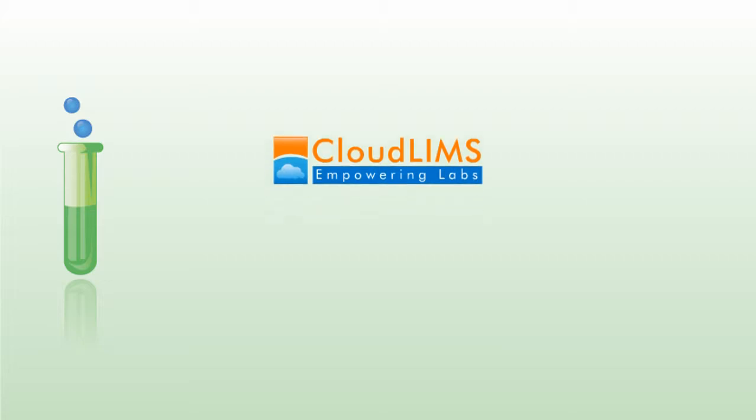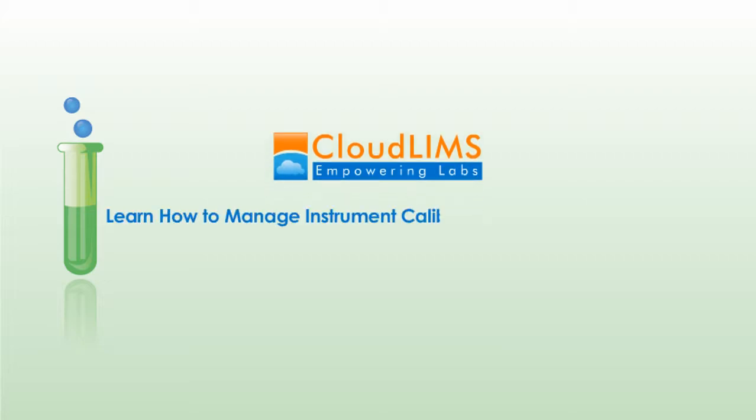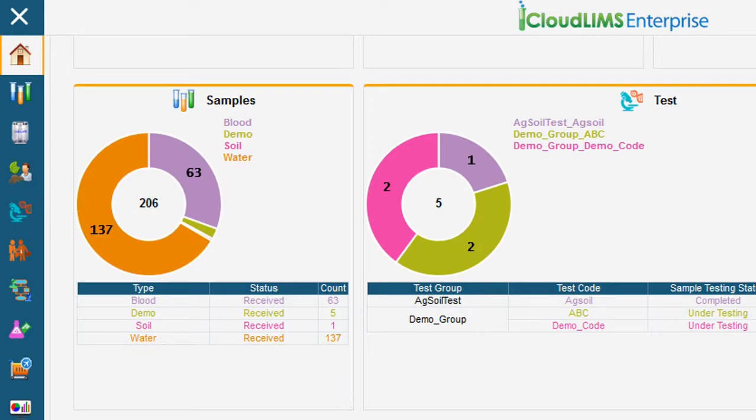Hi, this video will walk you through the process of management instrument calibration and maintenance data, an important requirement for ISO/IEC 17025:2017 regulatory compliance. The first step is to configure new equipment or its component.